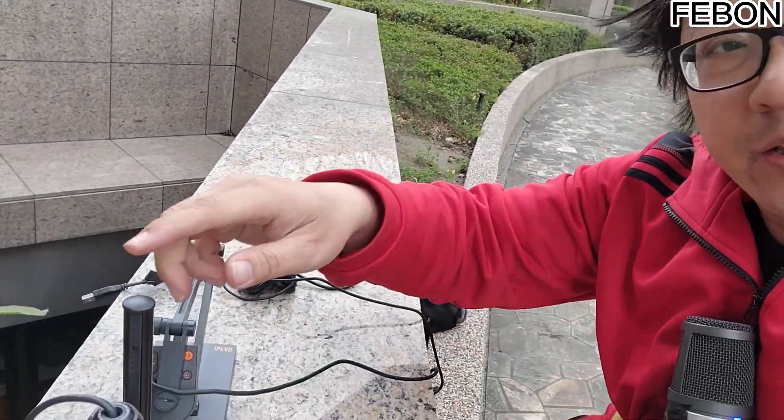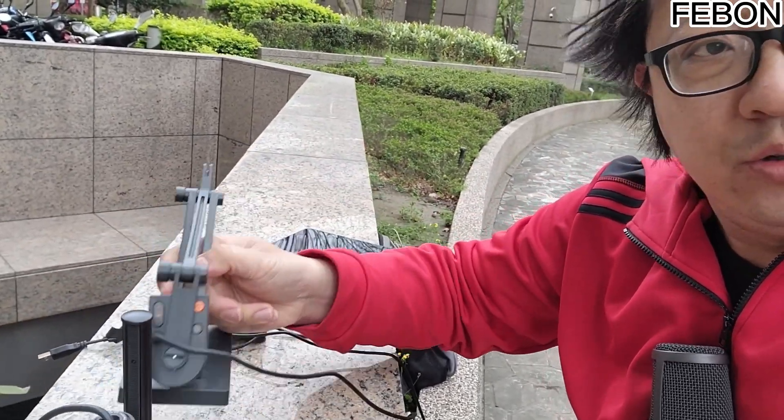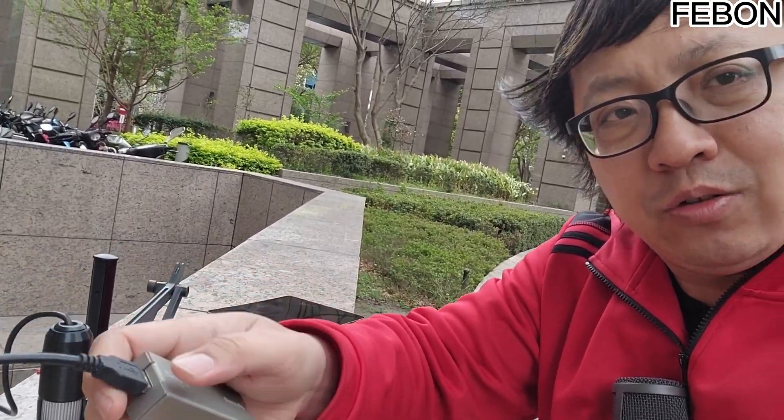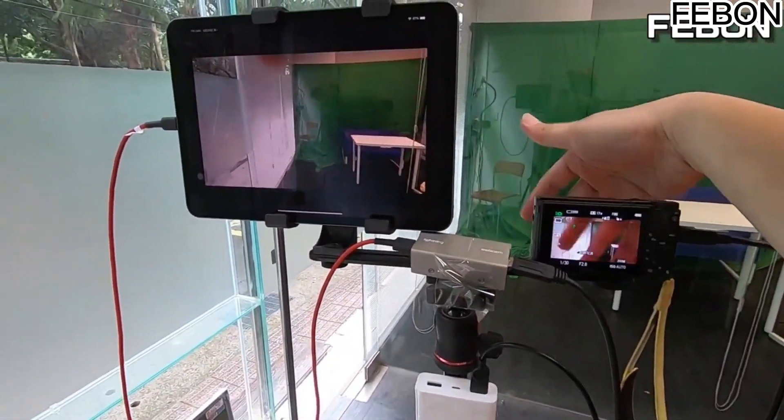What we just demonstrated is a microscope connected to this USB. In addition to connecting these USB document cameras and microscopes, you can also connect a DSLR. The HDMI output of the DSLR can be connected to a UVC drive-free capture card, and then connected to the webcam interface, so that it can be used — that is, the iPad is used as the screen of the camera.